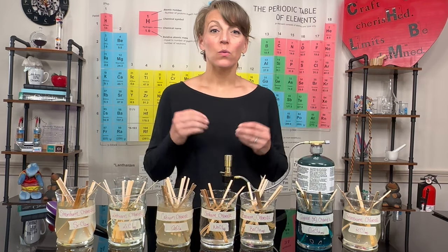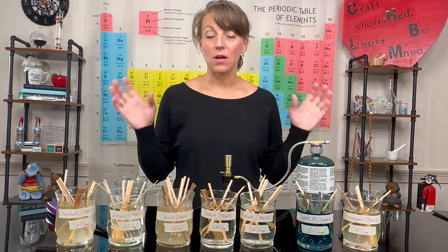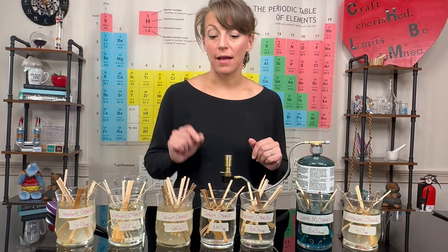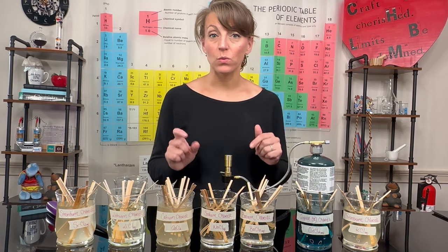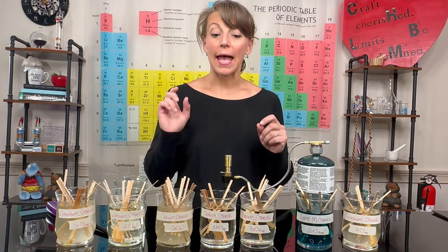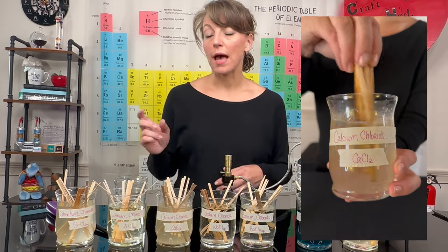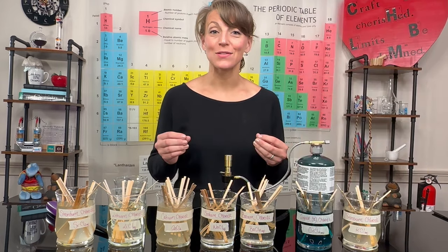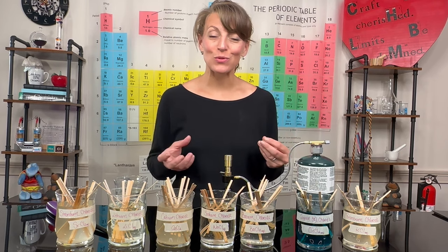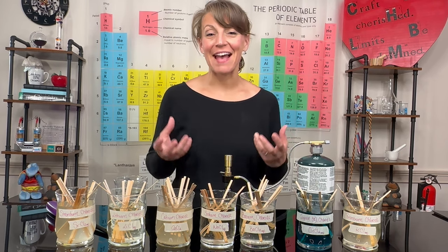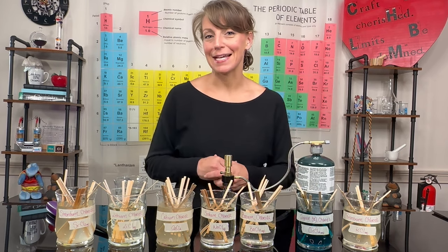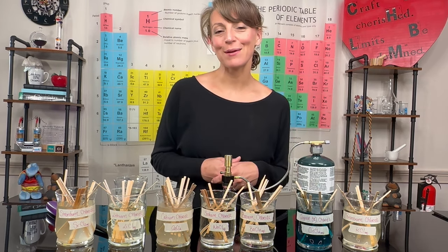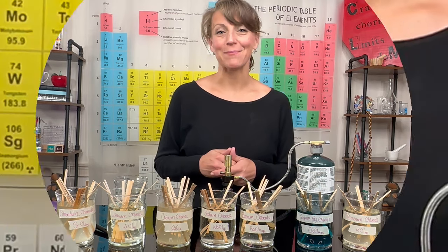We've placed a variety of different ionic compounds in water, and into those solutions we have soaking wooden splints that are absorbing these cations and anions. The only other thing we need for this experiment is a flame.